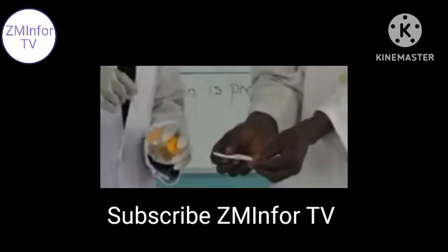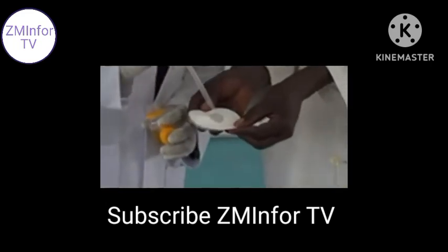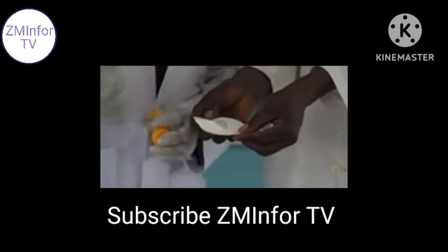We just have a few drops of oil on a white paper. This is a filter paper, very common in the lab.